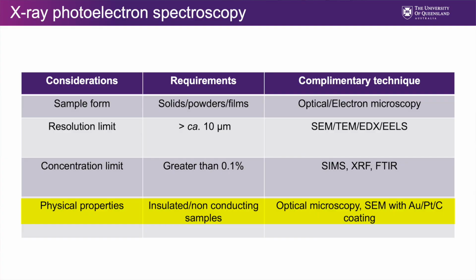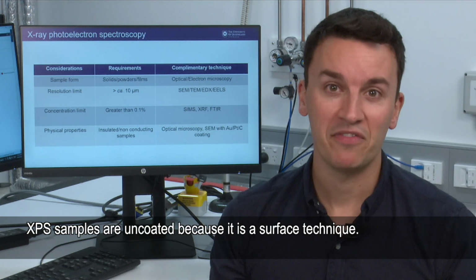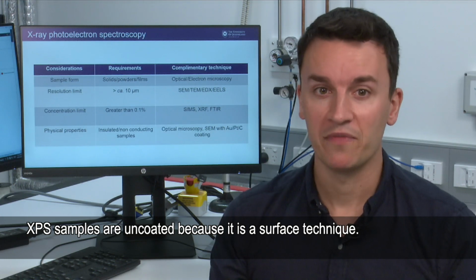And finally, the physical properties of samples. The good news is we can look at a wide range of different materials, conducting samples, non-conducting samples, insulating samples. We just need to be aware of that when we prepare the samples. So it's similar to doing optical microscopy or doing an SEM with a coating. With XPS we can't coat the samples because it is a surface technique. So that's where XPS does shine through over something like SEM.